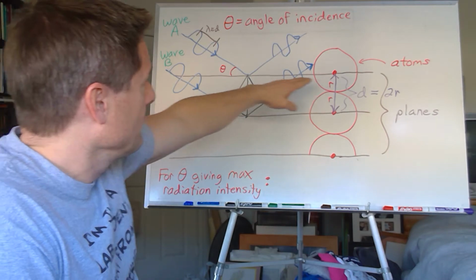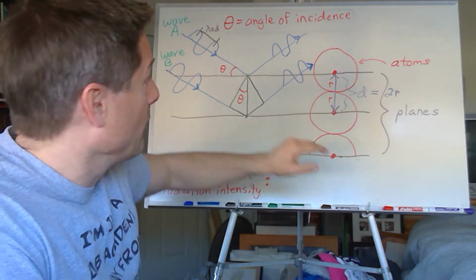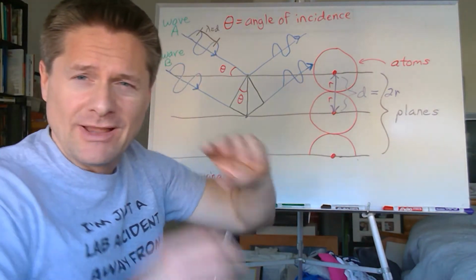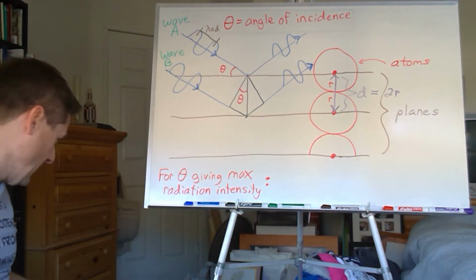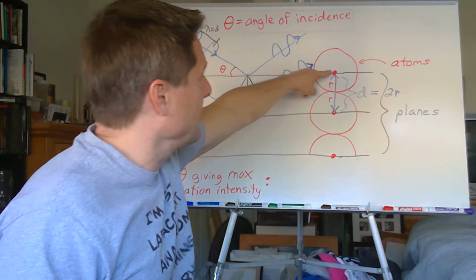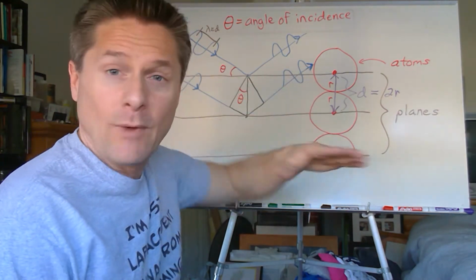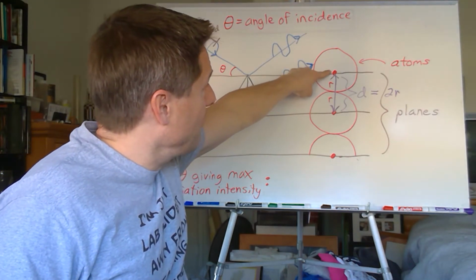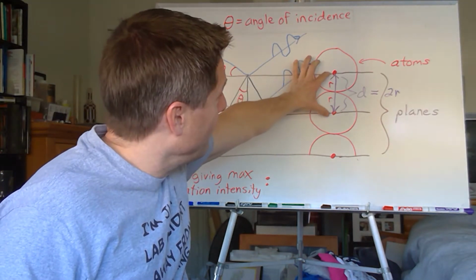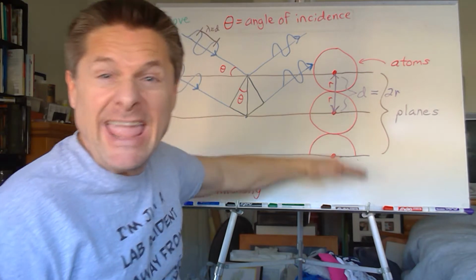So here's kind of what Max von Laue was looking at. You've got this crystal. So let's zoom in on just the top two surfaces of a crystal spacing. All right, so here's the atoms on the surface, a regular array, next layer, right? And then you've got the center of that one, the nucleus of that one. So you've got this distance between these planes, right?